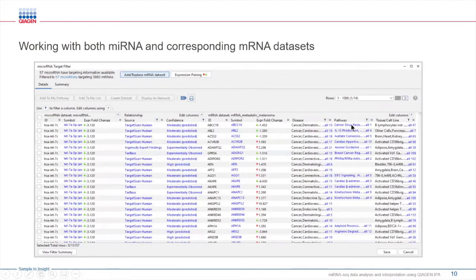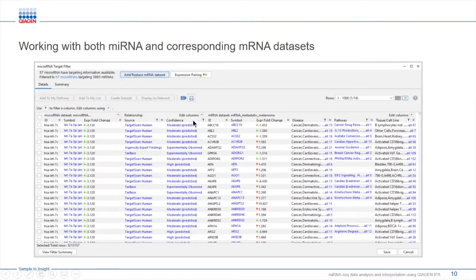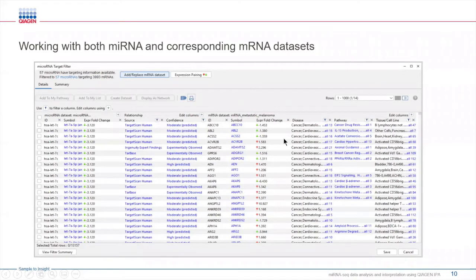Many of you mentioned in the registration that in addition to working with a microRNA dataset, you also have mRNA data. With the microRNA target filter, you can take advantage of mRNA data coming from your experiments to refine this target list. Here, you are comparing both microRNA and mRNA datasets and identifying targets coming from your mRNA data.